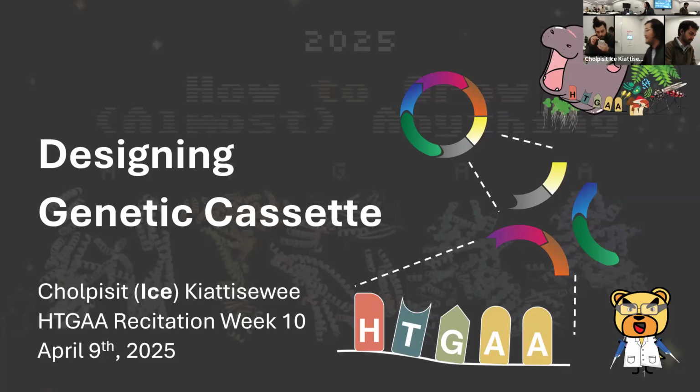All right, we have a good number of people in the room here, and today is going to be a kind of spatial session, where I'm going to talk through the DNA cassette design. The reason that we are trying to do this is because we are trying to move forward with the DNA synthesis and with the order through Twist, where they're giving us a pretty generous support. And if we don't do the design in time, we may not have time for them to do the synthesis and get back to us so that you guys at MIT here can work on your projects with the given DNA.